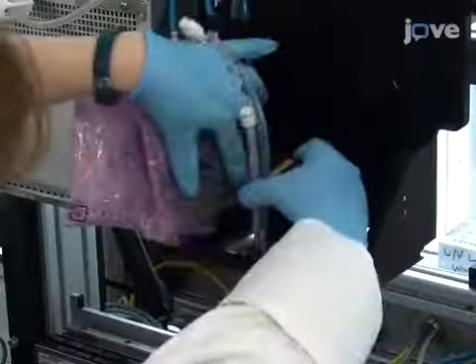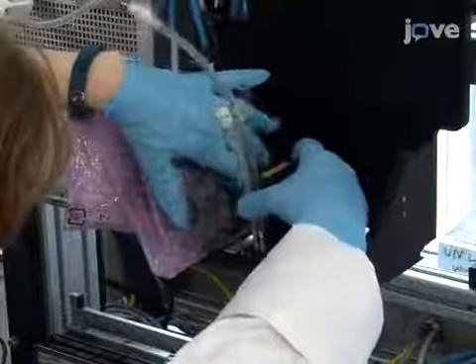After this, load the cartridge into the printer. Connect the print head to the GI hole.